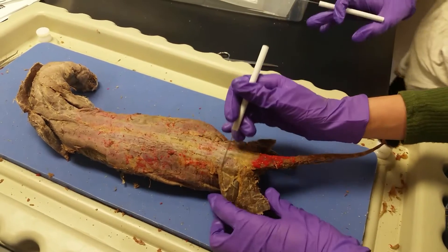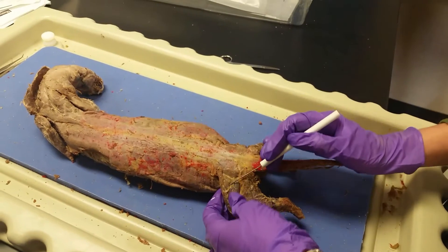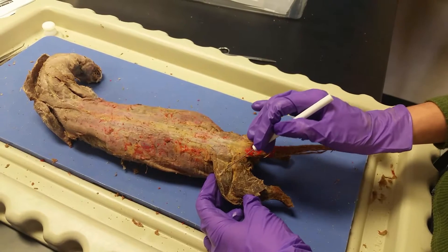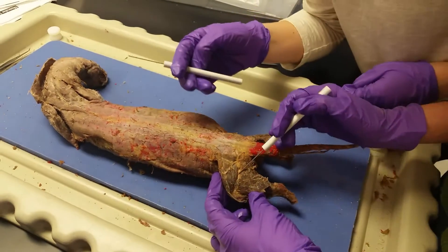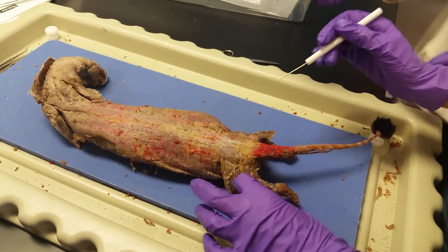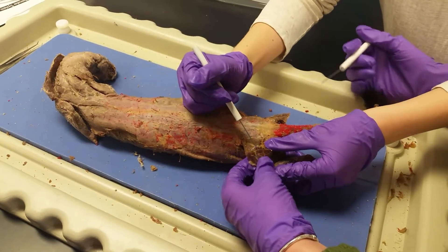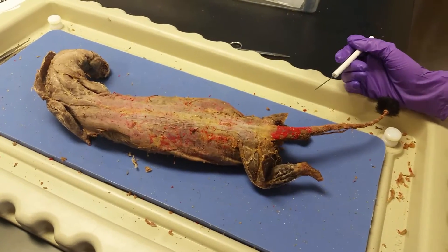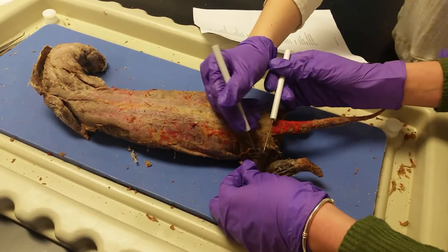Here we have the gluteus maximus — it's this big muscle on both sides — and then the tensor fascia latae. The vastus lateralis is right here. The biceps femoris is this big muscle, which has been cut. On the backside of the biceps femoris, there's this one, which is called the tenuissimus — right there. Super thin.